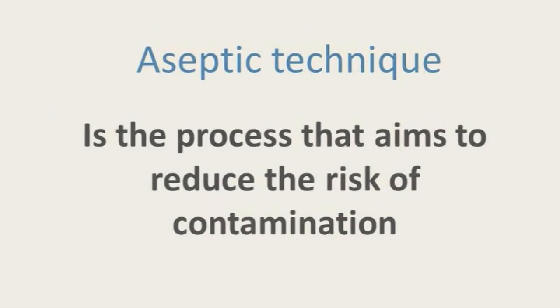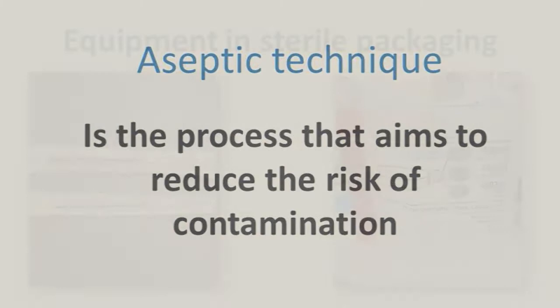Aseptic technique is a procedure used when working with cells. The technique aims to reduce the risk of contamination. Contaminants such as mycoplasma, yeast, bacterial and fungal spores need to be controlled and kept to a minimum. A single incident of contamination can spread throughout a lab and have the potential to shut a whole lab down.